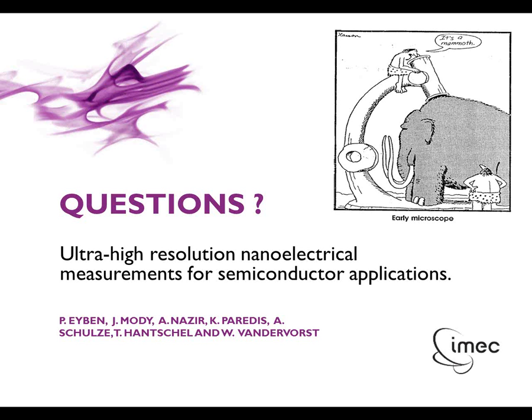And that pinning will basically mean that you will become much less sensitive to variations in what you're interested in, maybe the carrier concentration or actual work function of the material, because you're dominated by that pinning. Which is why, for carrier profiling, KPFM is rarely used, and the preference usually goes to methods like the capacitance or the resistance methods.